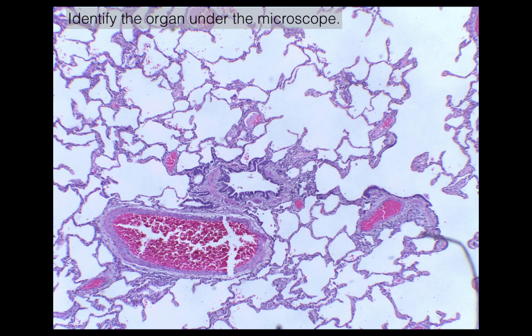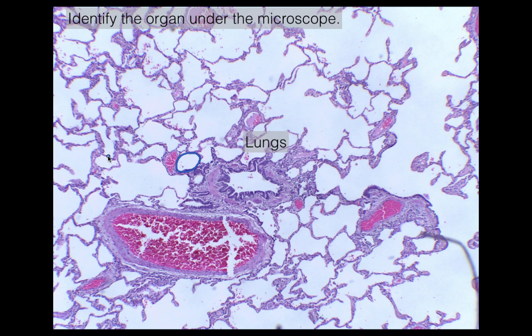You should have said that this is the lungs. Some of the characteristics you can see: we have our alveoli — those little circles you see are all alveoli. Other things we're going to see in this slide are the bronchioles and the arterioles, which are the larger tube-like structures. Both are lined with smooth muscle, but the bronchioles are going to have this kind of deep purple epithelium that lines them.